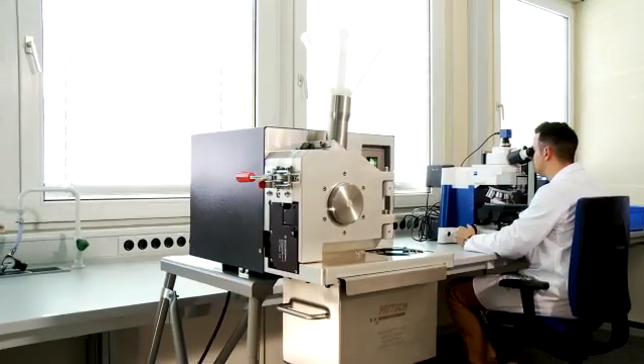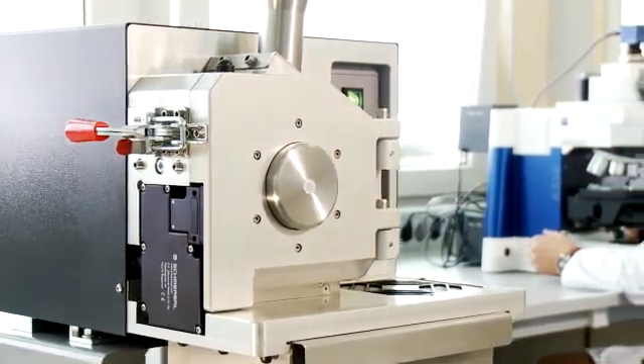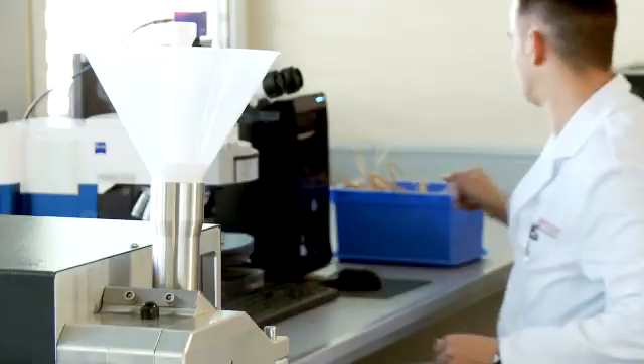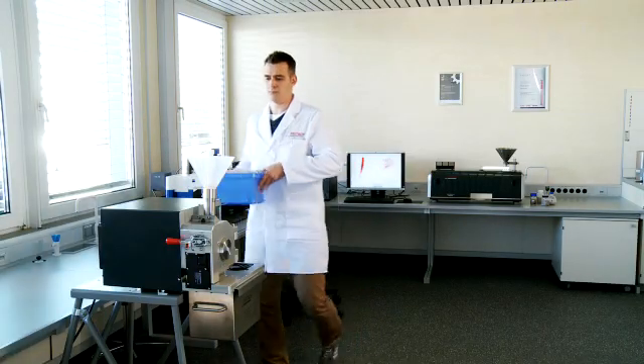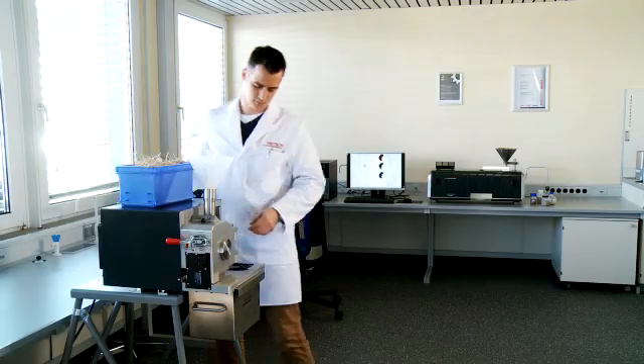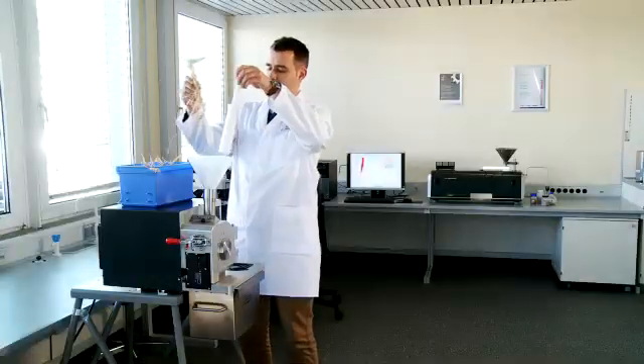Cutting mills are ideal time-saving assistants in daily laboratory work. They are suitable for size reduction of soft to medium-hard, fibrous and tough materials, plastics and heterogeneous mixtures. We will demonstrate the key points of cutting mills and how they work.